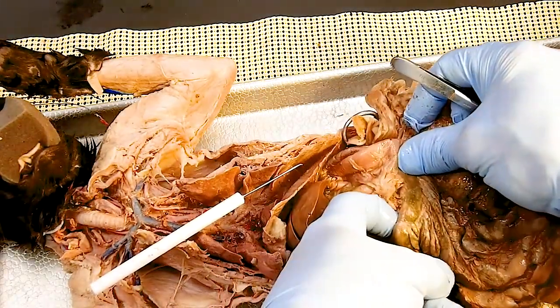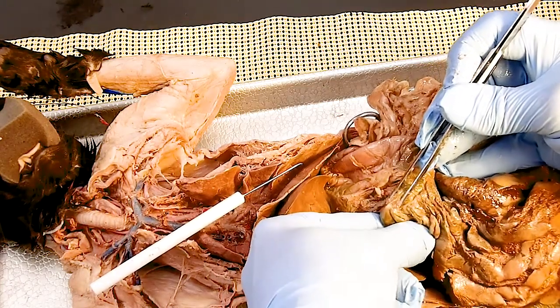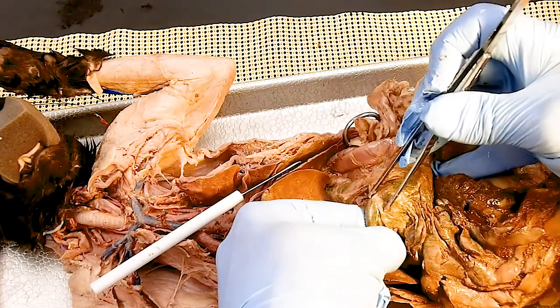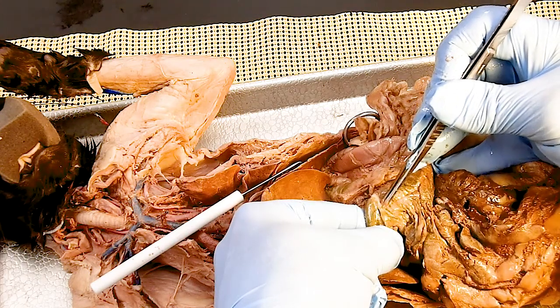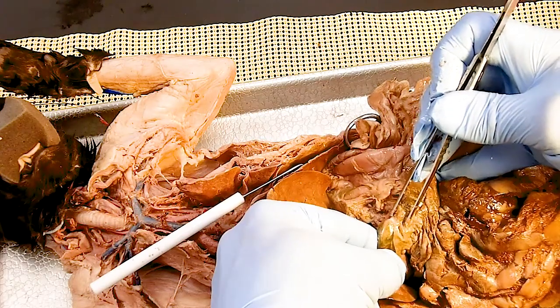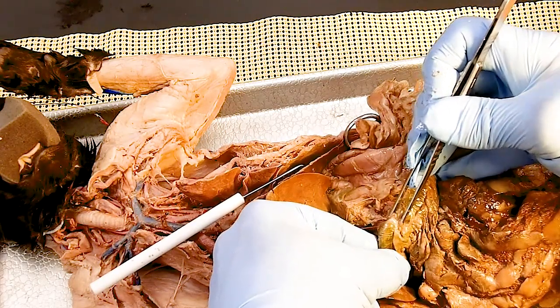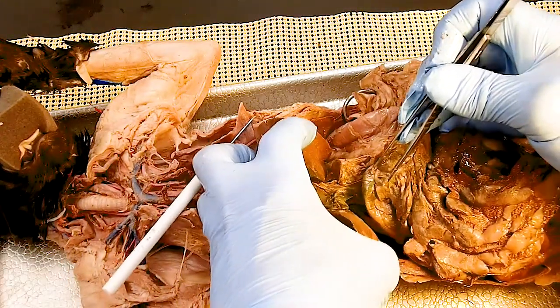Then at the downstream end of the stomach, pyloric region, it ends right here, and this is the small intestine or duodenum. You'll often see a little constriction there because there's another sphincter there. That's the pyloric sphincter between the stomach and the small intestine. And that one is visually easier to see externally. Like I said, you can usually see a little constriction there. It's all stained green here because this is where the bile comes in.